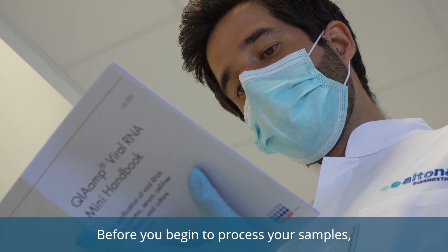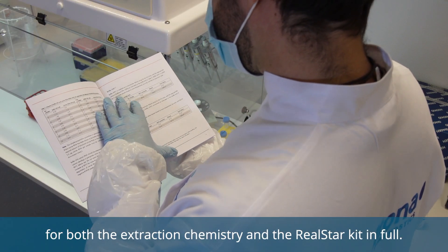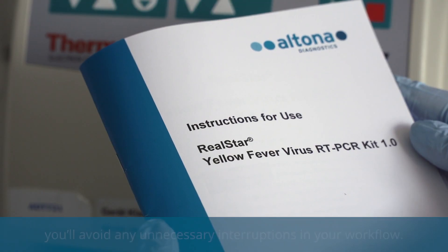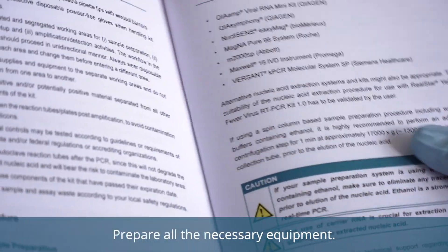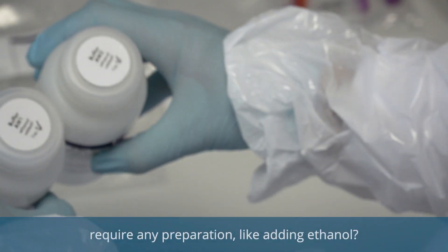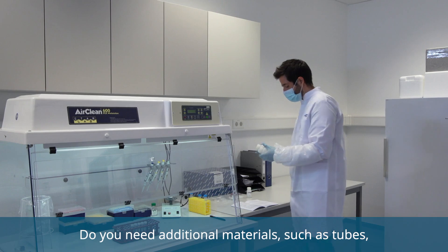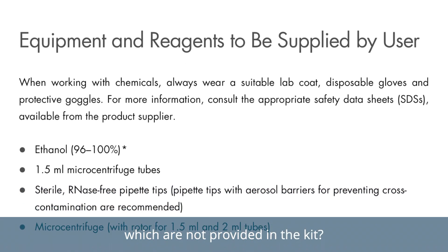Before you begin to process your samples, please read the manufacturer's instructions for use for both the extraction chemistry and the RealSTAR kit in full. By reading the instructions for use, you'll avoid any unnecessary interruptions in your workflow. Prepare all the necessary equipment. For example, does your extraction chemistry require any preparation, like adding ethanol? Do any kit components need to be thawed? Do you need additional materials, such as tubes, which are not provided in the kit?